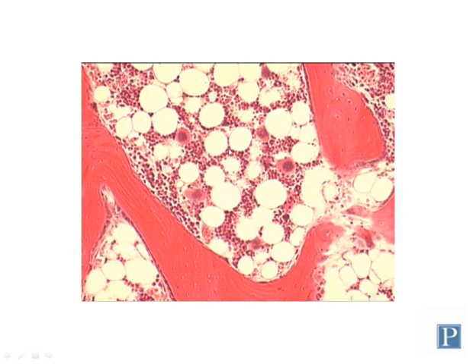This is a section of bone marrow. So this is going back to the bone marrow slide. The only slides that we have that show you the bone marrow are the sections of the long bone that have been decalcified. So I would go back and look at those. Here you can see some trabecular bone in this slide. You may not have trabecular bone in your particular slides because there's not a lot of it in long bones. And this is the marrow cavity right here.